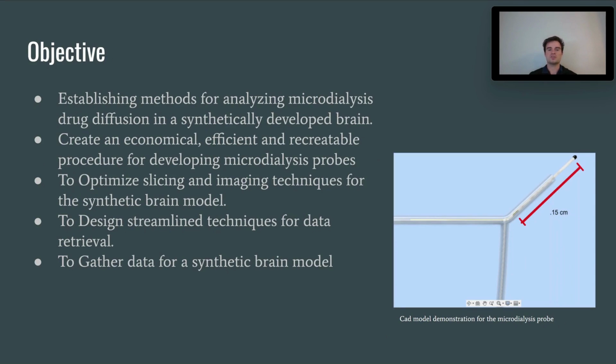Because of this motivation, the objective of our capstone team is to establish new methods for analyzing microdialysis drug diffusion in a synthetically developed brain, to create an economical, efficient, and recreatable procedure for developing microdialysis probes, to optimize slicing and imaging techniques for the synthetic brain model, to design streamlined techniques for retrieving data, and to provide data utilizing a synthetic brain model rather than that of an animal brain model.